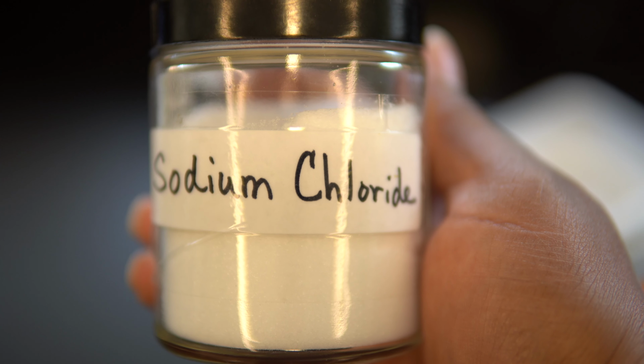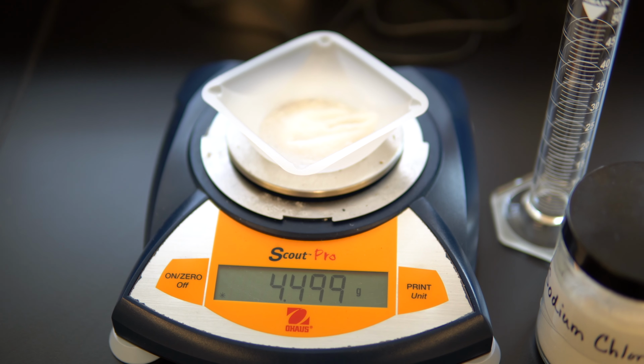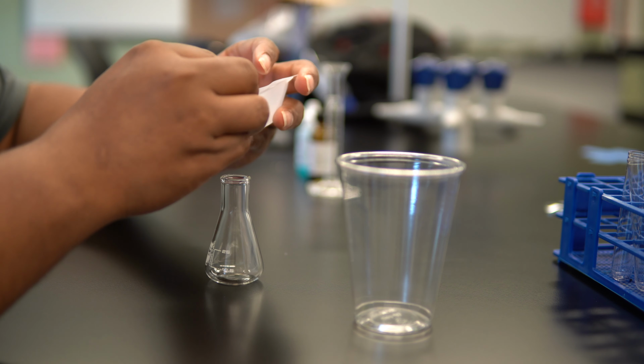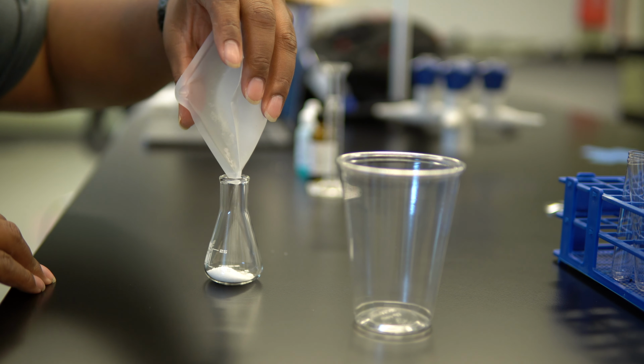Preparation. Prepare 15 milliliters of a concentrated sodium chloride solution as follows. Tare a weigh boat, then weigh out 4.5 grams of sodium chloride in the weigh boat. Bend the weigh boat in half and pour the sodium chloride into the 25 milliliter Erlenmeyer flask.